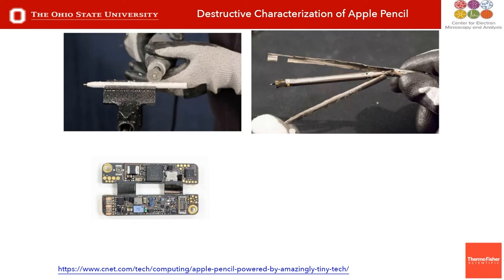Note that they have on protective gloves because these sharp edges are probably razor thin. And then you can actually extract a computer chip. So you can start to see the components and the electronics that actually help control and run the Apple Pencil.